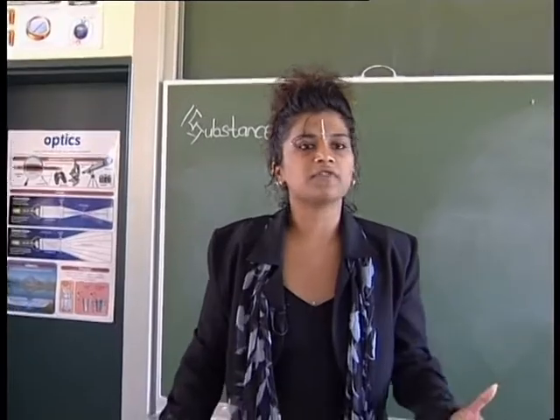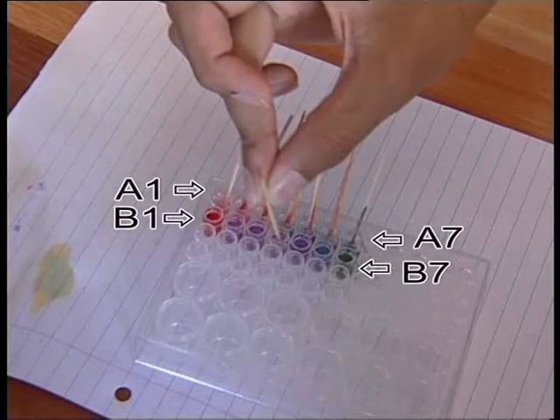How can you work out the pH of a solution in wells in row B? We already know the results of row A, so we can use that to compare to row B. Learners are able to compare the colors of the wells in row A, which were tested with universal indicator, with those in row B tested with cabbage-water indicator.